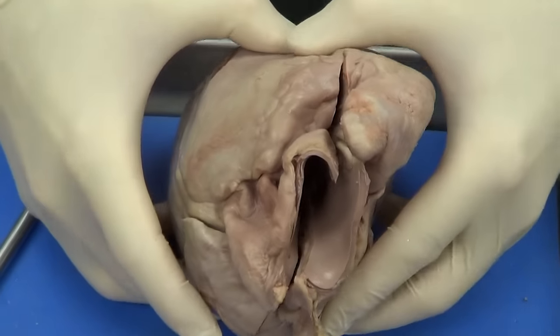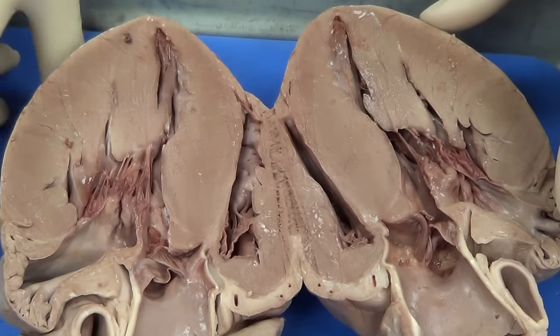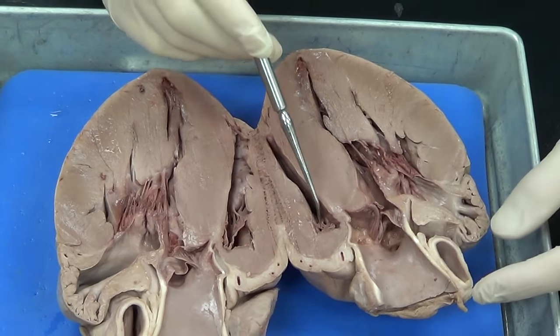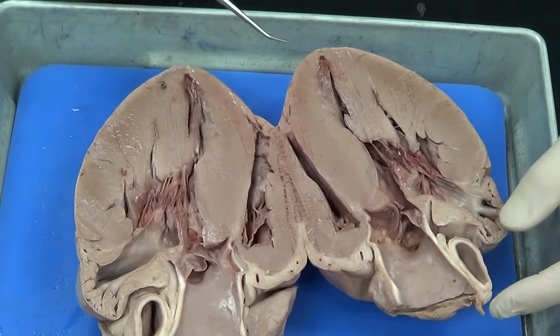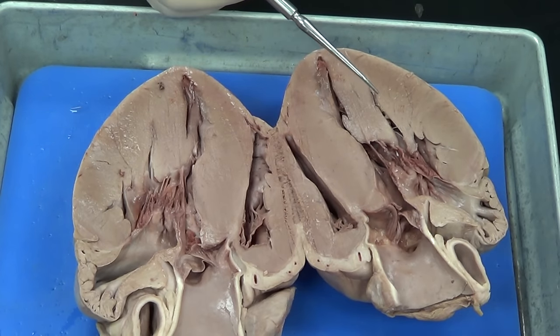Let's go ahead and open up the heart and take a look at the internal anatomy. This heart has been bisected in two, and we can see various chambers here. There are different ways to cut the heart, but on each half of the heart we can see all of the chambers.